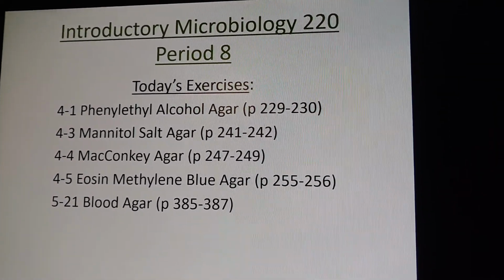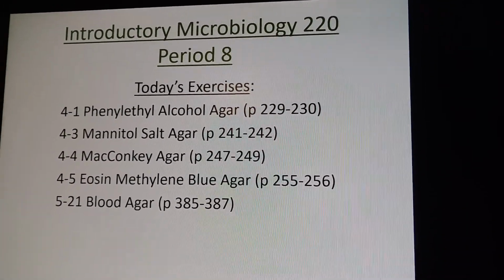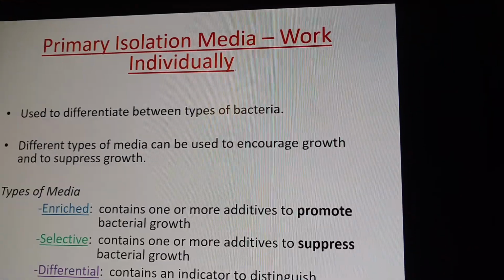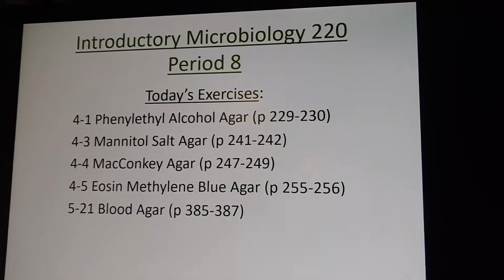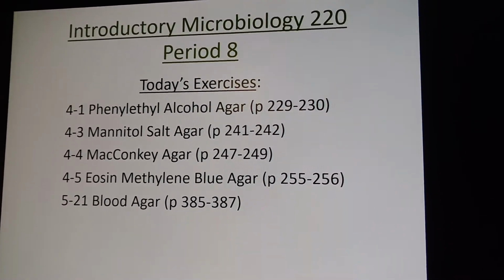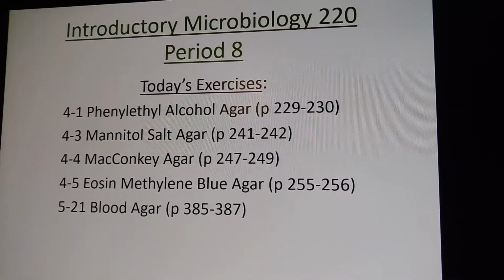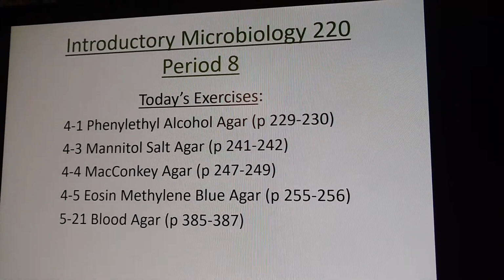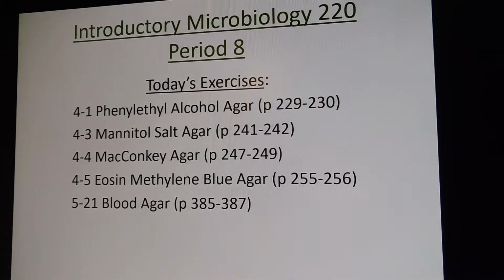You're going to need to study these things. And there's going to be a lot of this information throughout the rest of the semester, on your quizzes and your next lab practical, lab exam 2. So the types of media that you would have been inoculating, I think Nyan and Fawn and myself are going to, I hope, if we can still go to campus tomorrow, make a video showing you what you would have been doing, just spot inoculation, but we want to go over the results as well, what you should be looking for if you were to really get to do this.